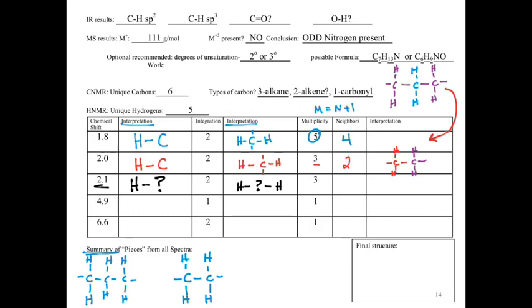Just because we have two hydrogens doesn't mean it's a carbon, because it could very well be a nitrogen. Nitrogen can have 3 bonds, so we could have two hydrogens attached and still be able to continue our structure. It most certainly can't be oxygen, because oxygen would be done with that. We'd be at water. The next part of this is our multiplicity, which says we have two neighbors. That actually tells us a substantial portion of information. So the very first thing that it tells us, and I'm going to try and stagger this, is that we have carbon. It's not a question mark anymore.